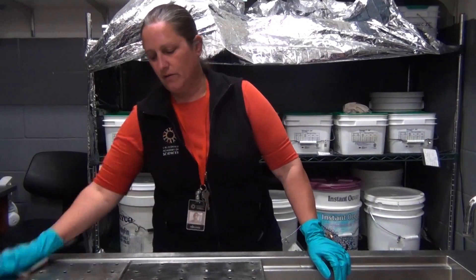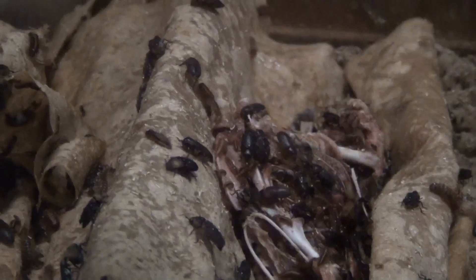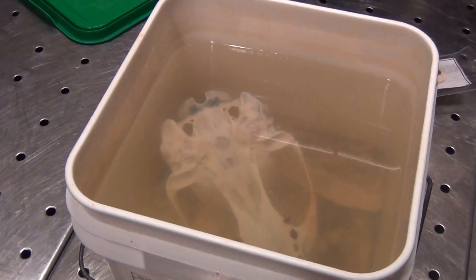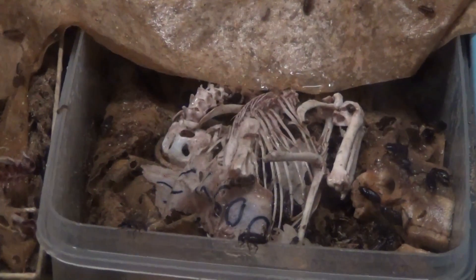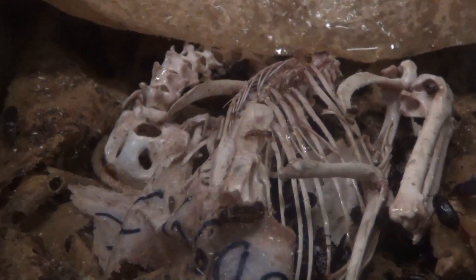Once it has been brought back to the lab, scientists clean off as much of the flesh as possible. Then the specimens go through one of two processes for cleaning off the rest of the rotting tissue. If it's a juvenile one that's very small and young, with bones not yet fused together, they'll use the beetles.